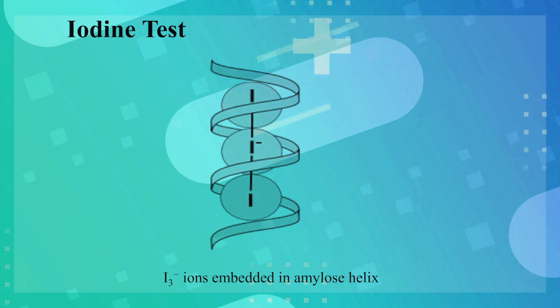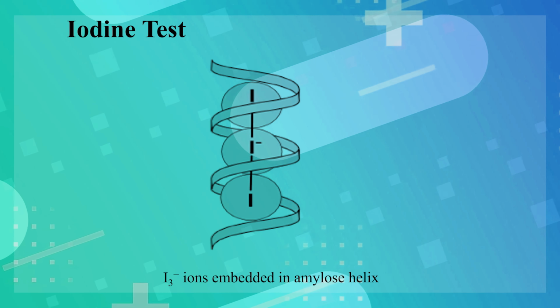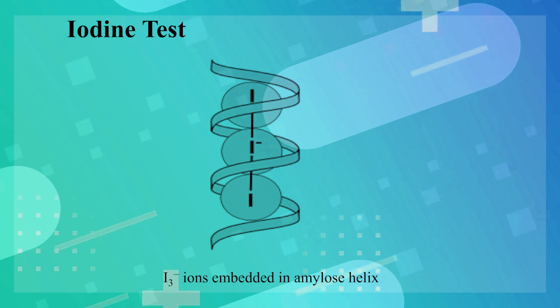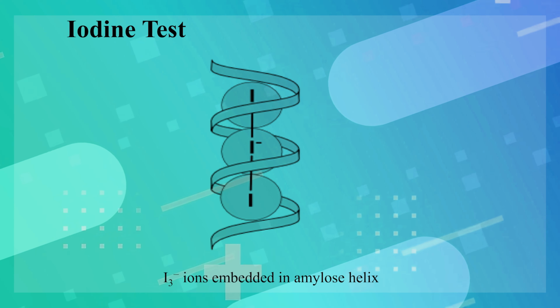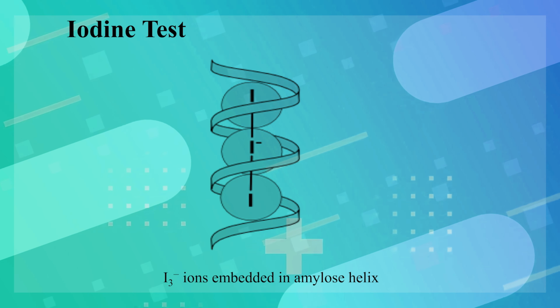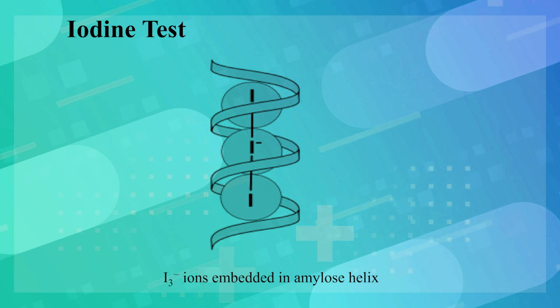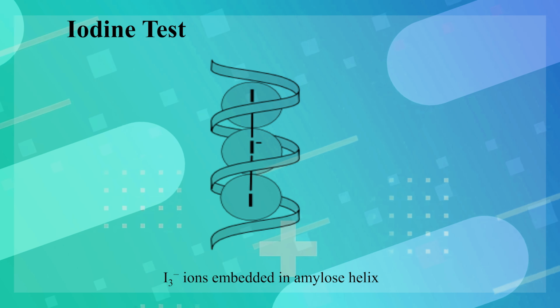Iodine test. The iodine starch test was first described by J.J. Colin and H.F. Gaultier de Claubry and independently by F. Stromeyer in 1814. The interaction between starch and the triiodide anion is the basis for iodometry.